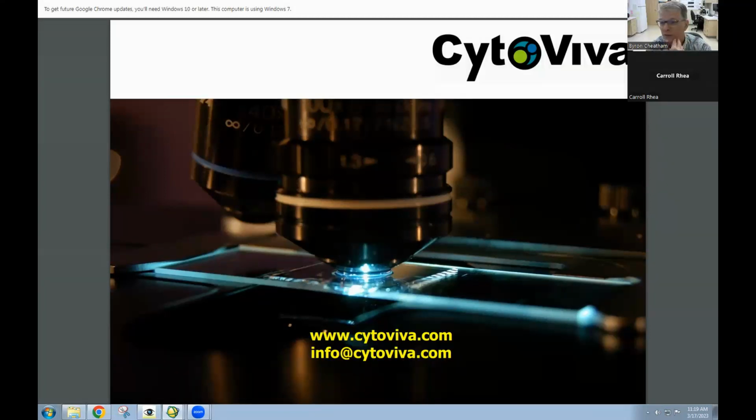You can use standard off-the-shelf microscope slides from Fisher or whoever for that. Honestly, some of the dirtiest things you'll ever see in your life are microscope slides when you look at them with CytoViva darkfield optics. However, we did find a vendor, and Carol, it's Schott, I believe, correct? Yes. They produce ultrasonically clean microscope slides. They're probably triple or more the price of standard slides, but they don't have anything on them. They really are the cleanest thing I've ever seen. So we recommend, when your experiment calls for ultra clean slides, so there's no confusion between your nanoparticles and dirt or smuts on the slide, that you use those slides, and we can provide you a link to acquire them if you need to. I don't have the link readily available, but if you send an email to info@CytoViva, I'll see it and I can send you any relevant information.